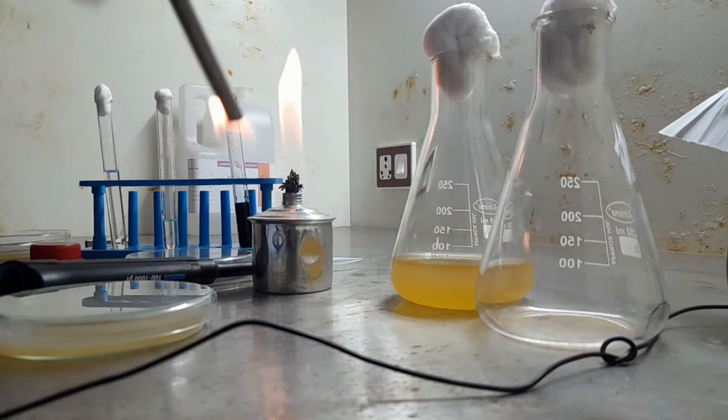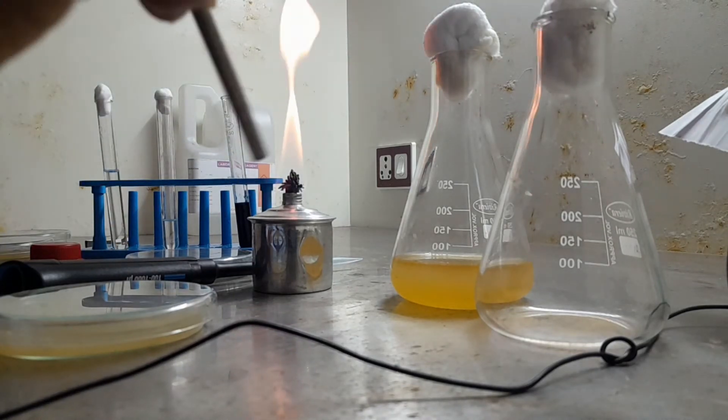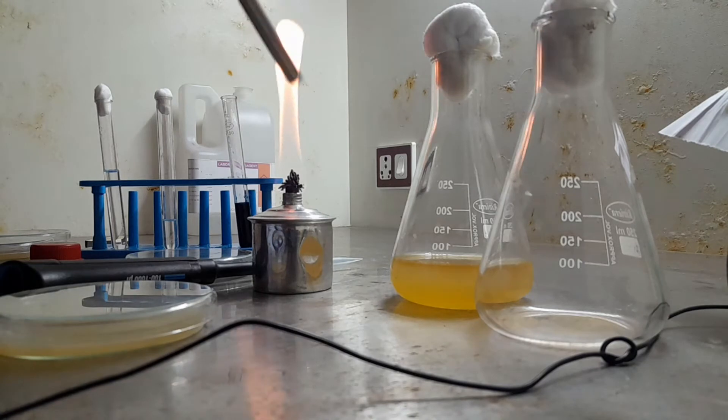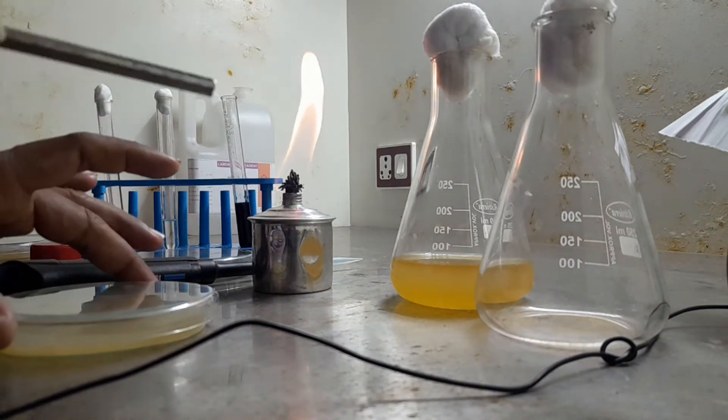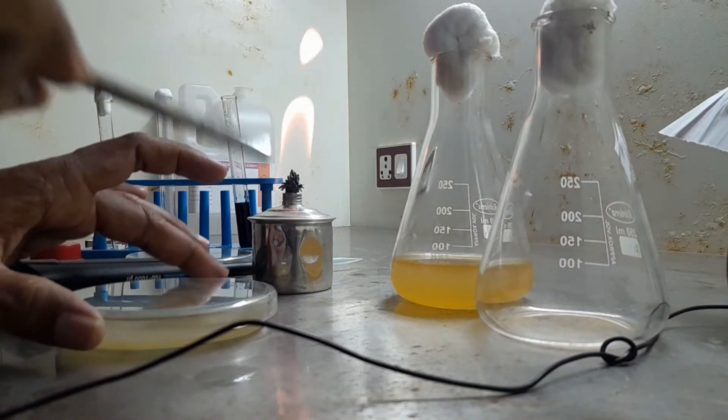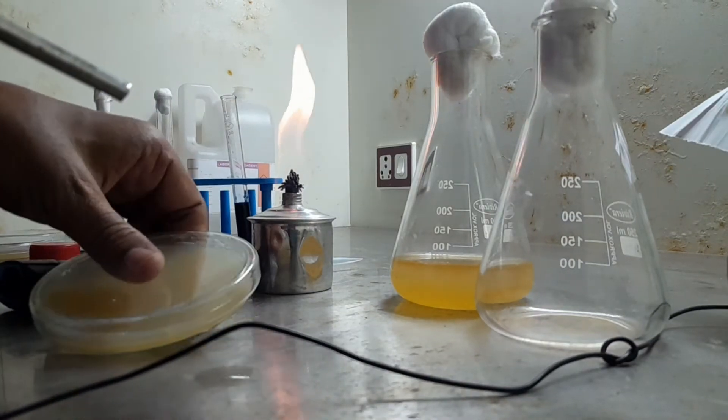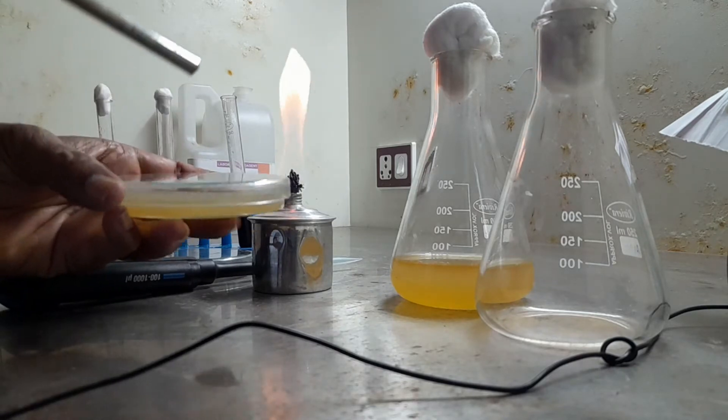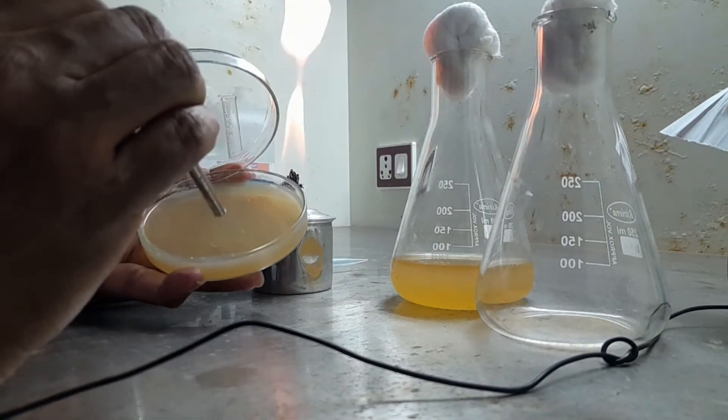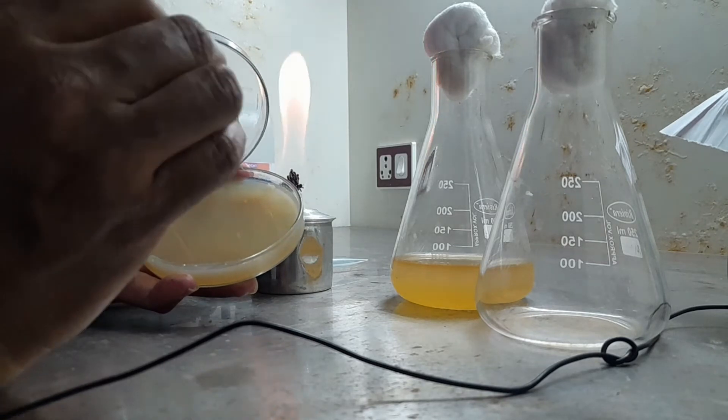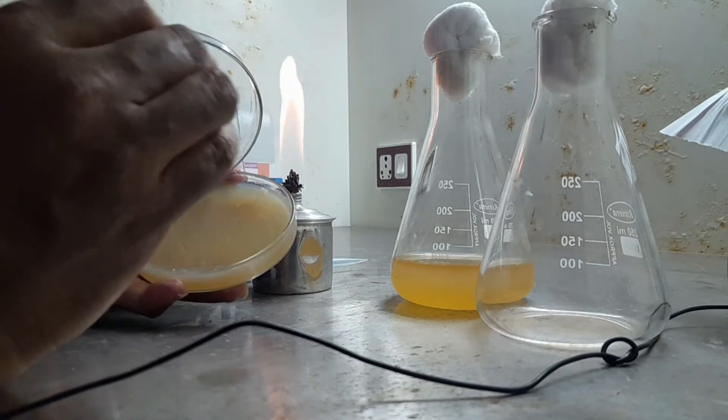Next, once you ensure there is no flame in the cork borer, what you do? Just how many wells you want, accordingly you prepare. You prepare 4 wells or 6 wells. This is how we prepare wells for well diffusion method.